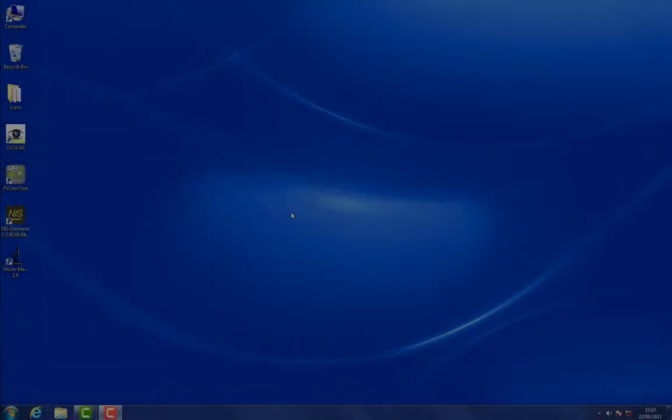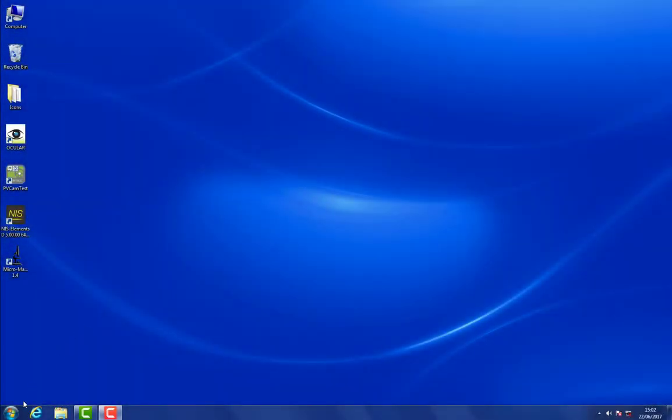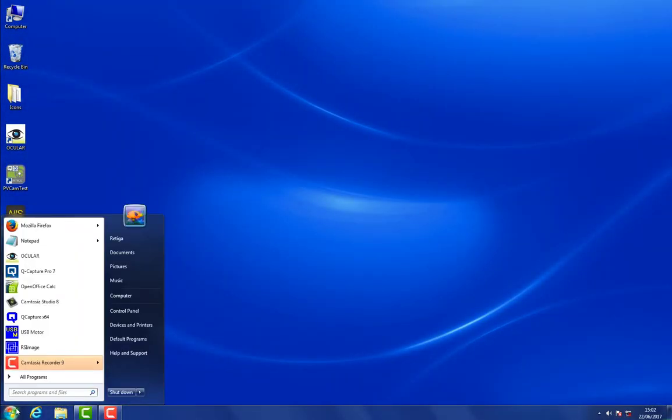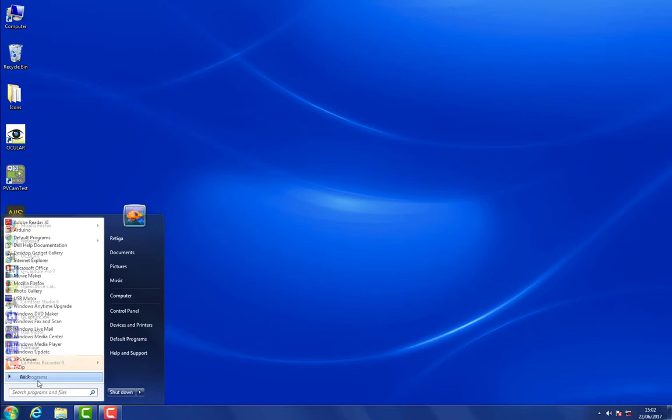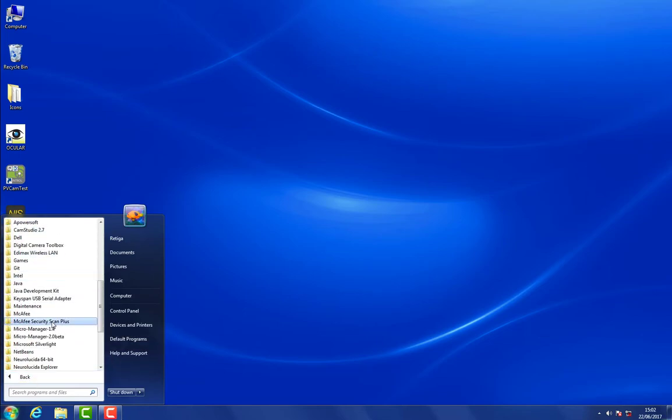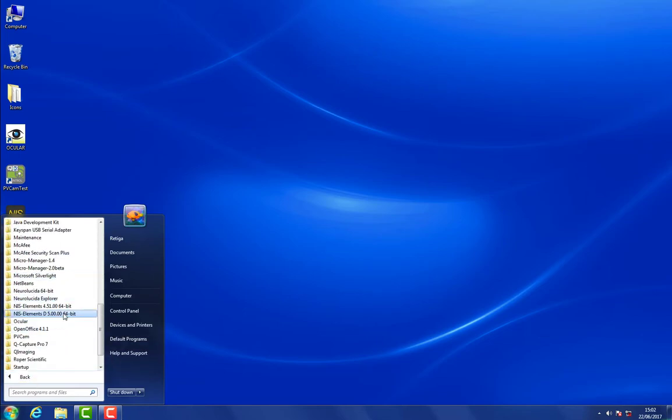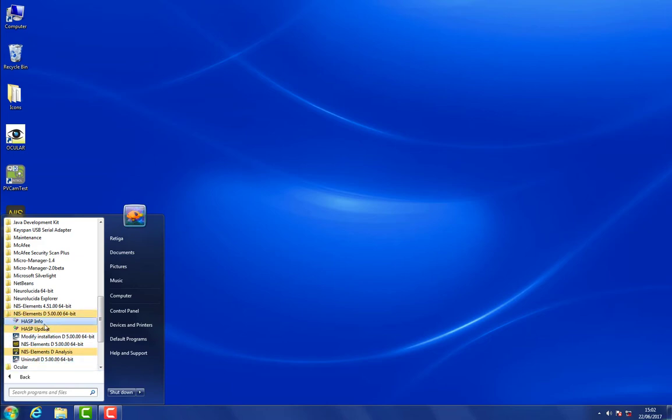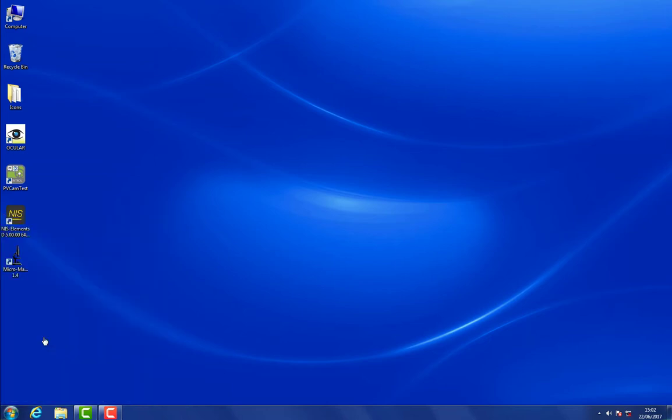So the cameras are running fine, we can add them into Elements. Now we want to go back to the Start Menu to find our Nikon Elements folder. What we want to do is modify the installation to make sure that our Photometrics drivers are included in our Nikon Elements installation.